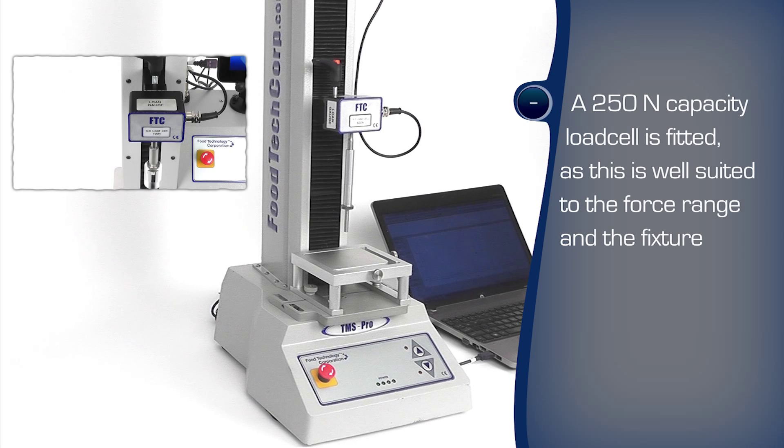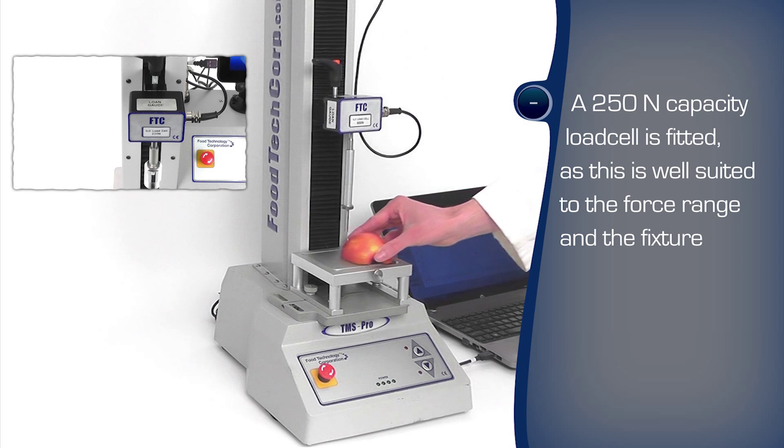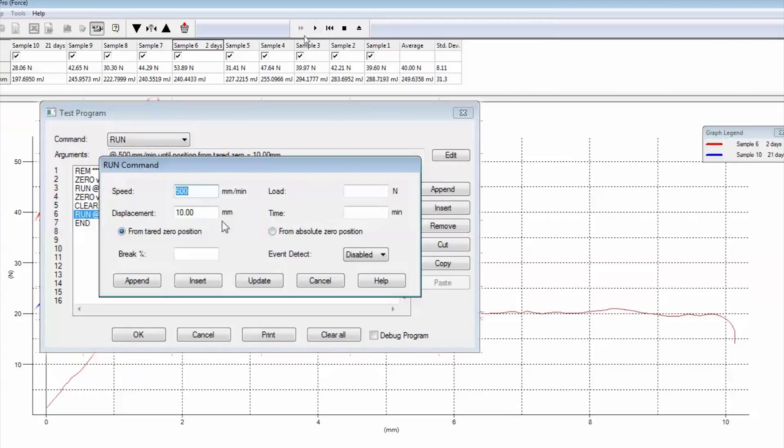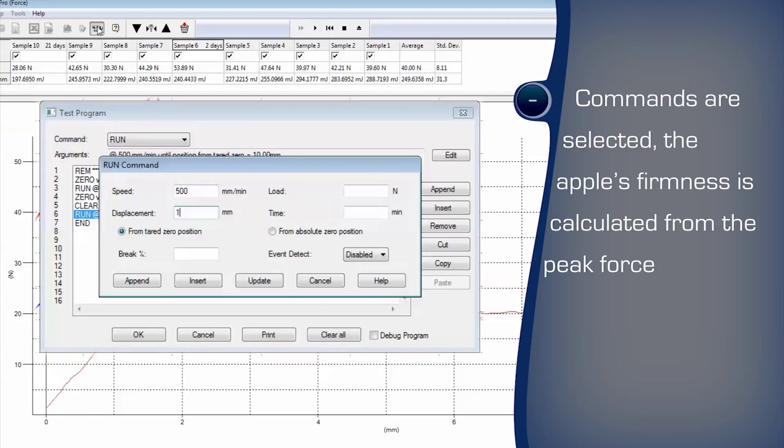A suitably rated load cell is used to maximize the measurement accuracy. The automated test program is easily written with the familiar Windows-based environment. The commands are selected to perform the steps. The apple's firmness is calculated from the peak force.